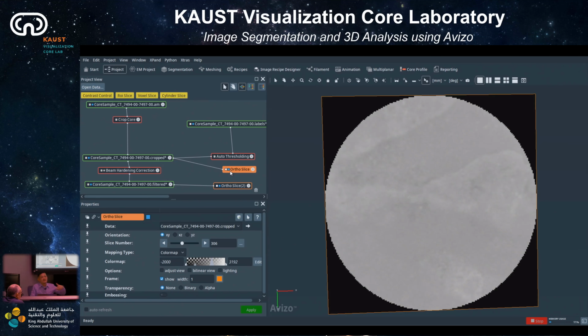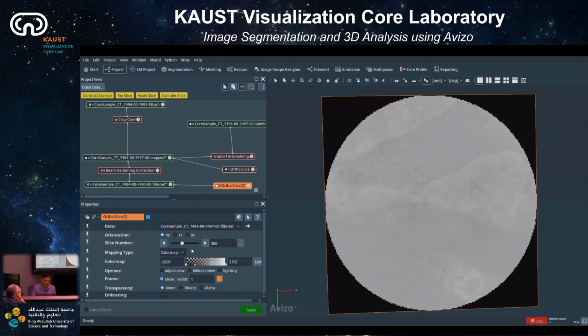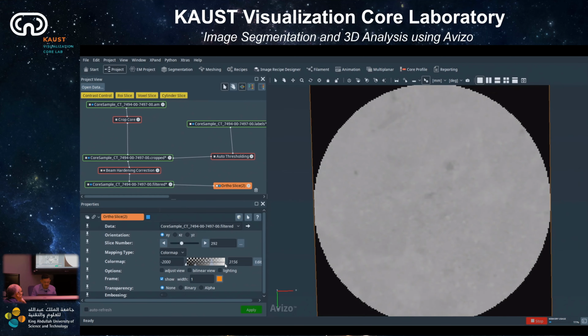So the point here is that there are options where you can apply filters like beam hardening. If you do background correction, you might lose the porosity. I'm not sure what you are interested in here. Probably if you look at this, you might see somewhere the porosity is like a crack. If you do background detection correction, you might lose it because it kind of averages the background.